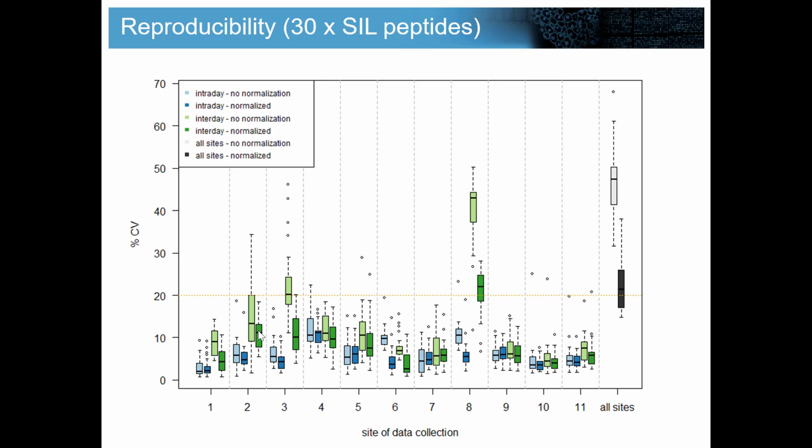So the normalization in label-free analysis is definitely worth doing. And the normalization that we applied is fairly naive, right? If this is just median normalization, there's probably cleverer ways to do that. I should also say that the way that we selected, well, this is now peptide level, but we also did protein level CVs. I didn't show that. And the way we selected the peptides to infer those proteins and to quantify those proteins was also fairly naive.